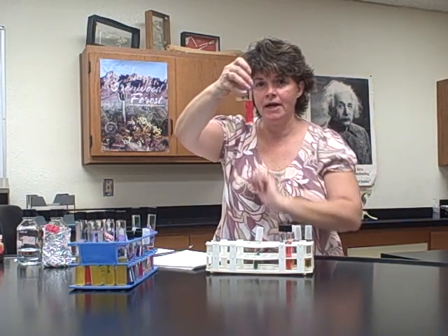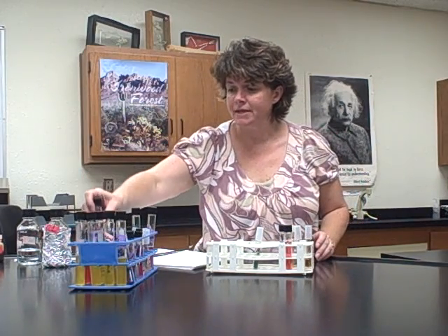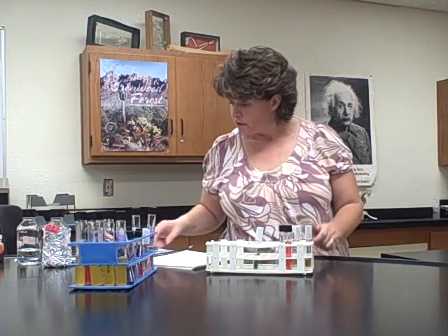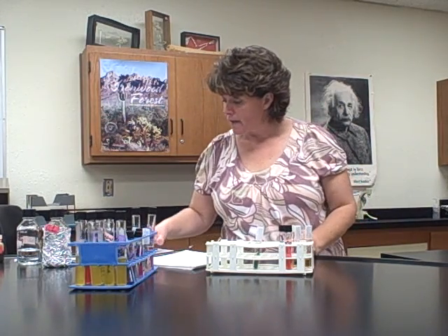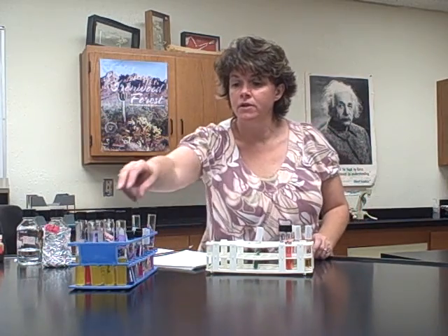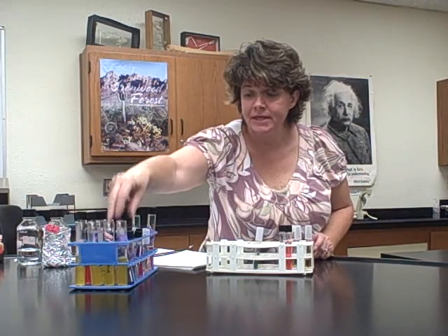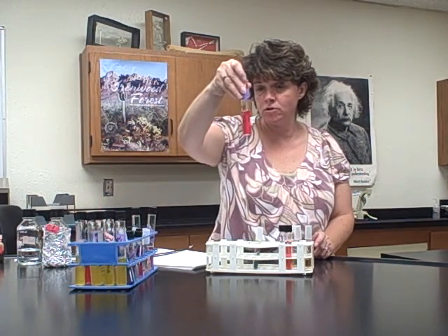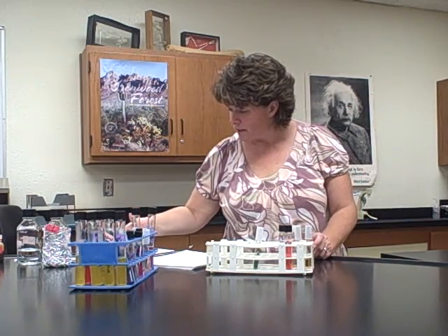If they stayed red, that means that they did not ferment the sugar. Because remember, the phenol red turns yellow in the presence of acid. And acid means that they fermented that sugar. So the color would be red, yellow, or pink, okay? Acid, yes or no. If it turned yellow, yes, that's acid. If it stayed red, that means no acid, okay? The last thing was gas.